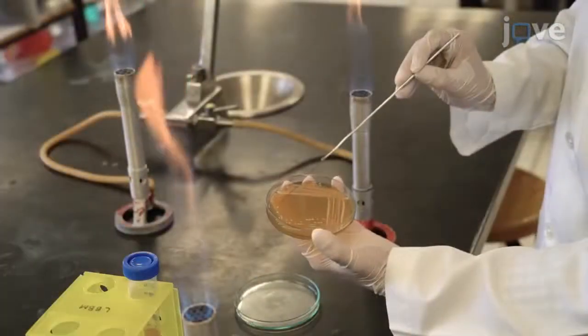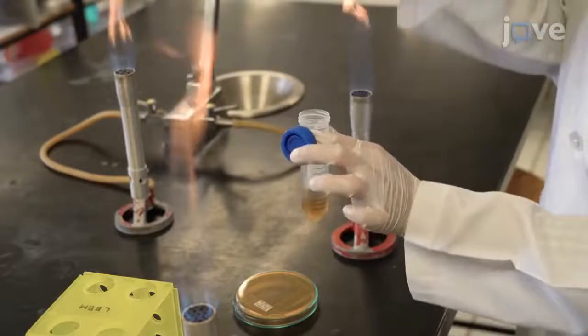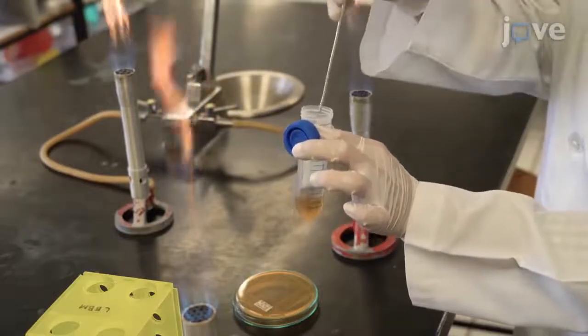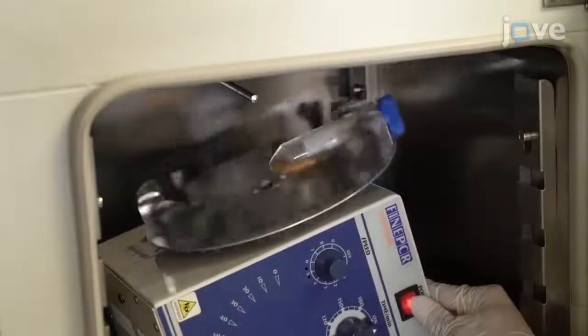Then inoculate a single isolated colony in a new conical tube containing 10 milliliters of cold sterile 2% YPD broth for overnight culture at 30 degrees Celsius with shaking.